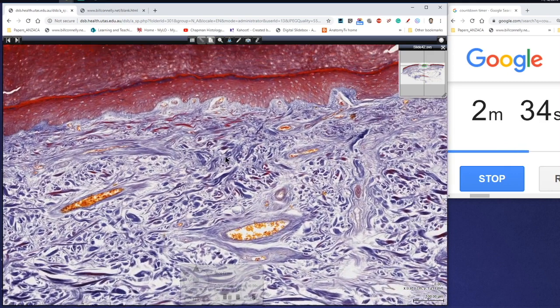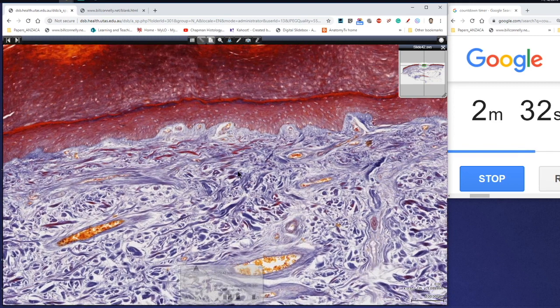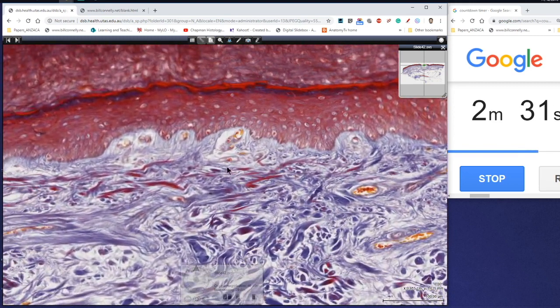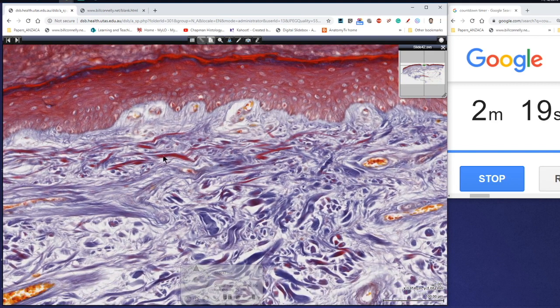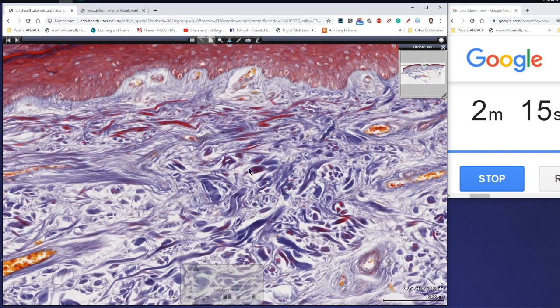We can actually see the difference between the loose connective tissue just directly beneath the epidermis and the dense irregular connective tissue of the reticular dermis here. Thin individual fibers in the loose connective tissue, whereas we've got these thick bundles of fibers running in many different directions. The spaces here are a little bit of artifact through shrinkage during processing for microscopy.